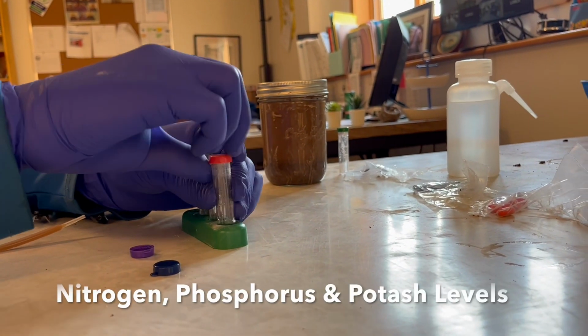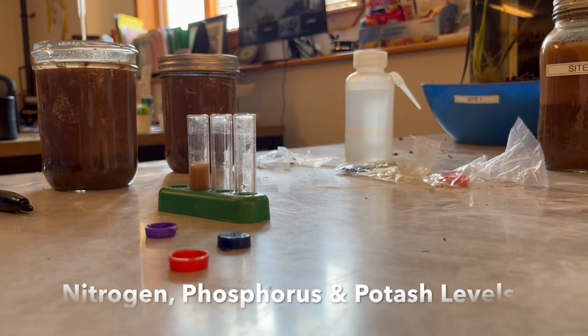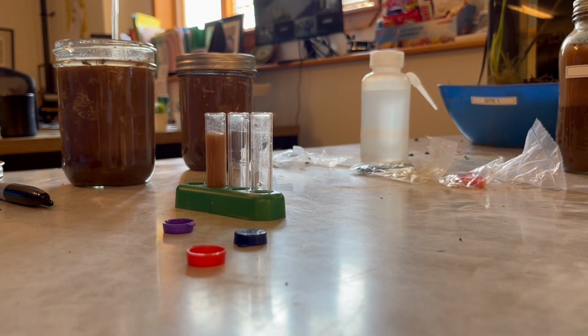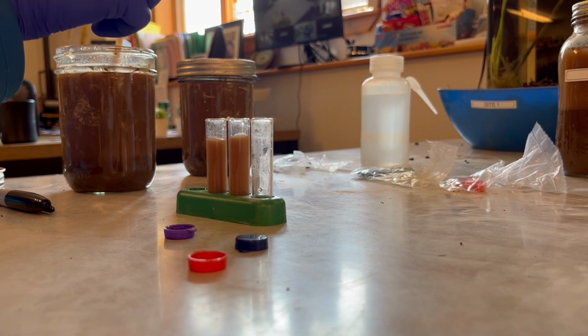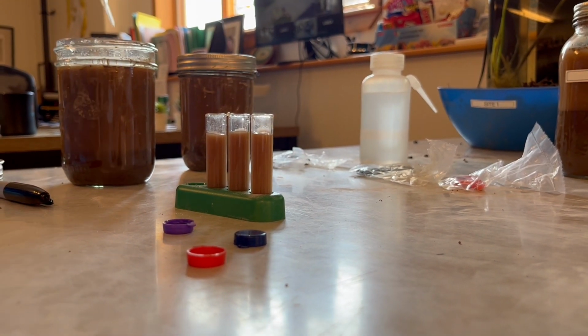For the next test, fill a jar with 1 part soil and 5 parts water for each site of interest. Allow the mixture to sit for 24 hours. Once the mixture has settled, fill the remaining tubes to the 4th line with the soil-water mixture, carefully avoiding disturbing the settled soil portion.